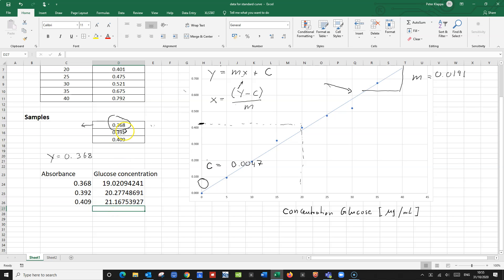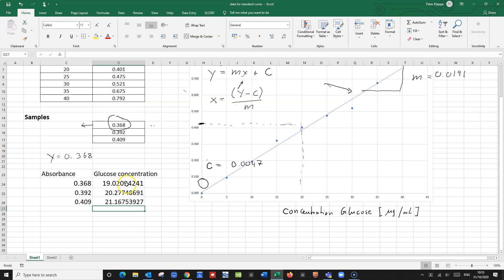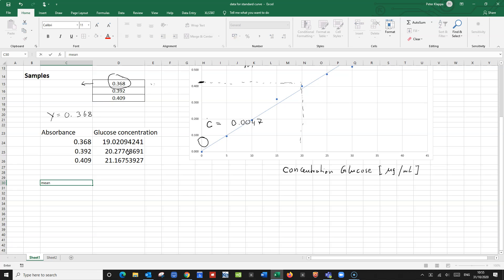So these are our three samples — the absorbance of the three samples — and we have now determined, simply from this line of best fit and from the equation that Excel provides us with, what the glucose concentrations are that give us these absorbances. And of course, we can calculate the mean of these glucose concentrations. So let's calculate that.